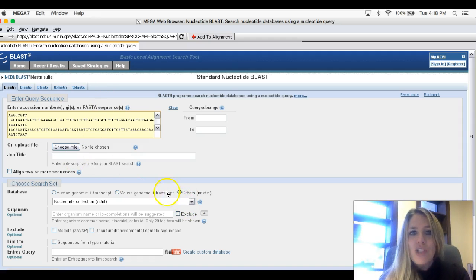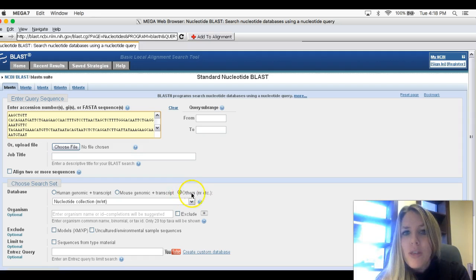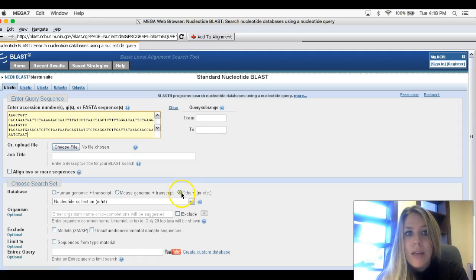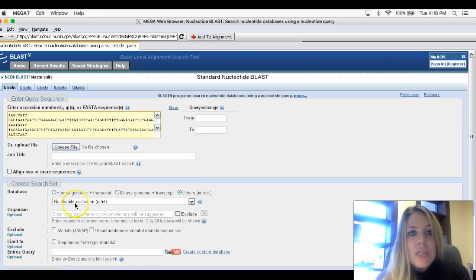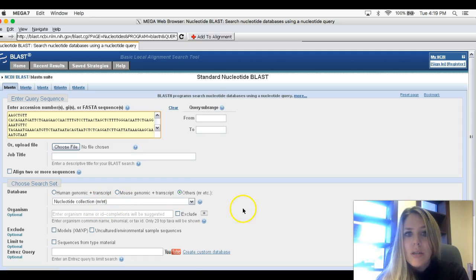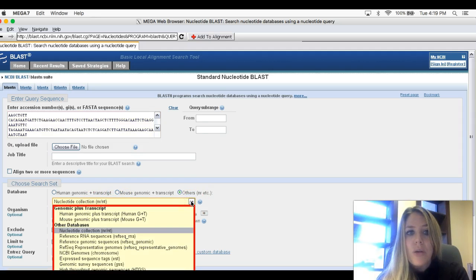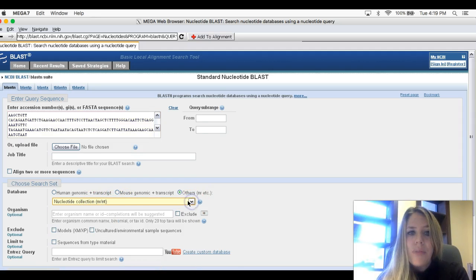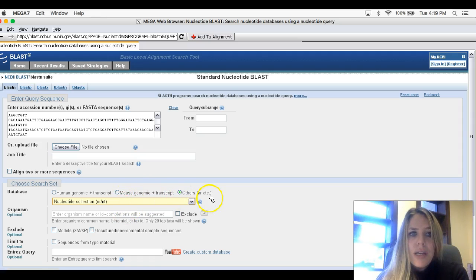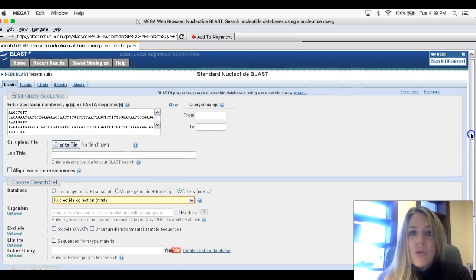Once that's in there, I'm going to do some checks here. I want to make sure Others is clicked on right there. I want to make sure this says Nucleotide Collection. If not, you can just pull down the window and find that. So Others, Nucleotide Collection. And then scroll down.